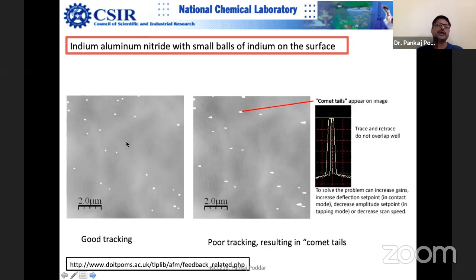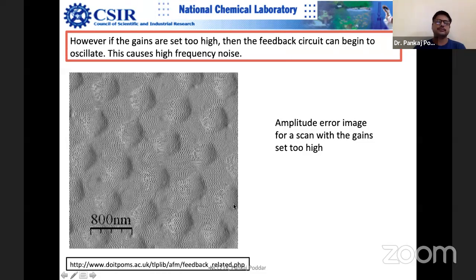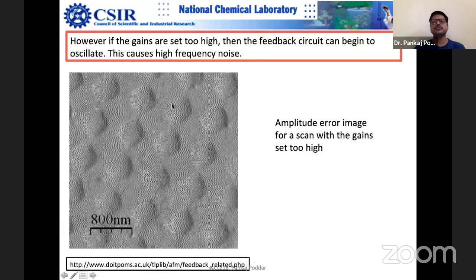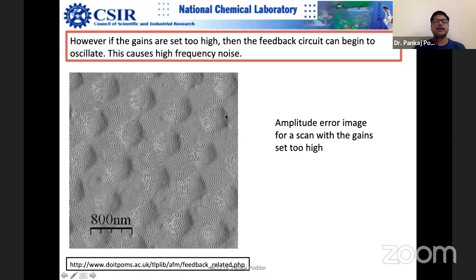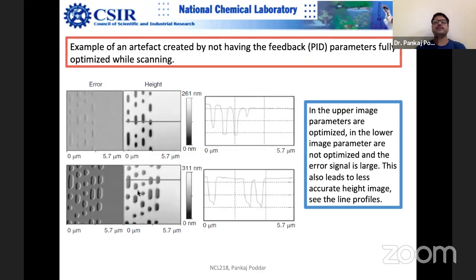These problems are practical. 12-13 years ago in our lab, all our images consistently had this kind of noise — we didn't know what was wrong at first. Students sometimes think the ripples are normal, but they are caused by gain being too high. Comet-type distortion means gain is too low. PID settings have to be very carefully optimized. The impact of un-optimized PID parameters creates these same artifacts.